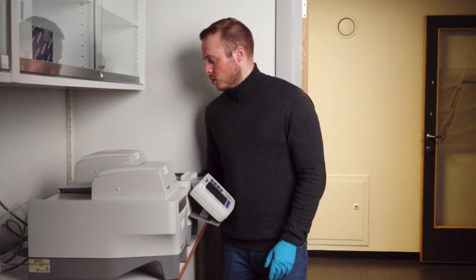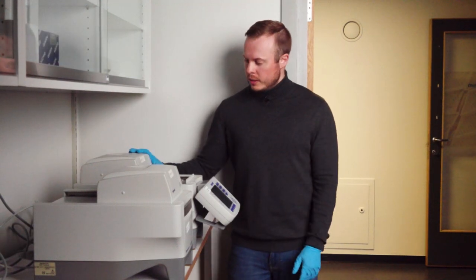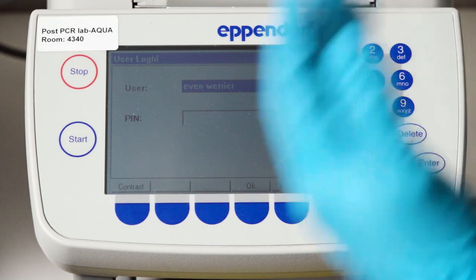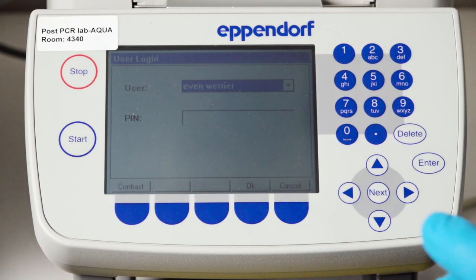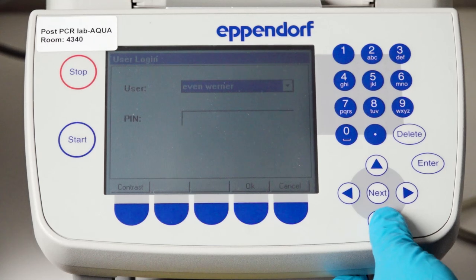We take up our samples, turn on the machine on the back side, and then you will see a green light here. The machine will say loading and it will take approximately one or two minutes, and then you will get into the login screen.